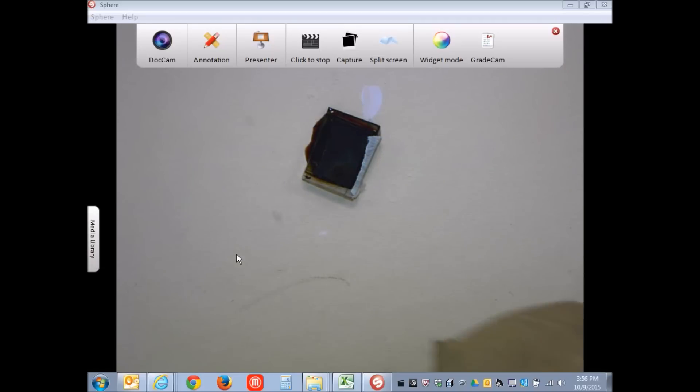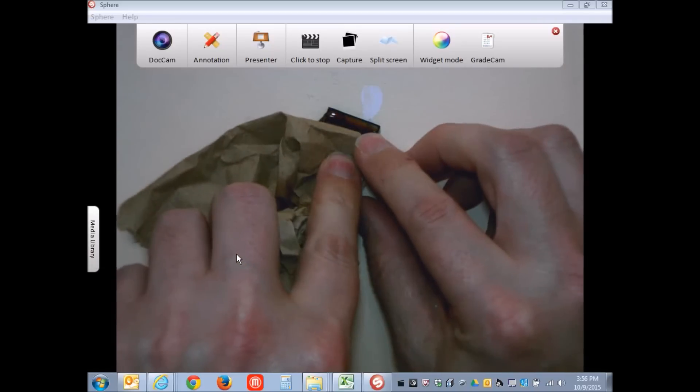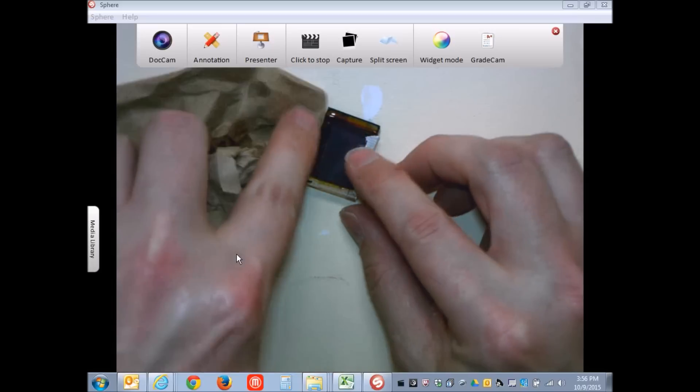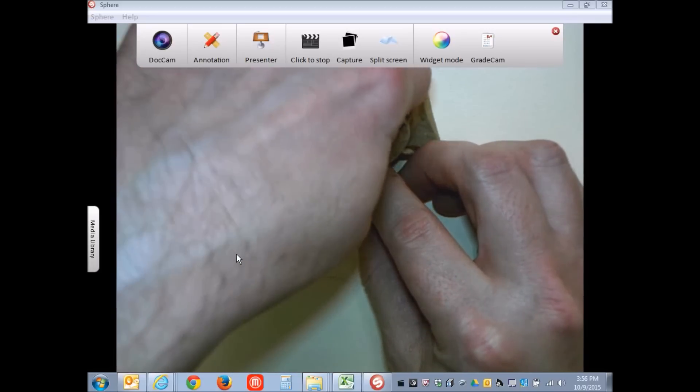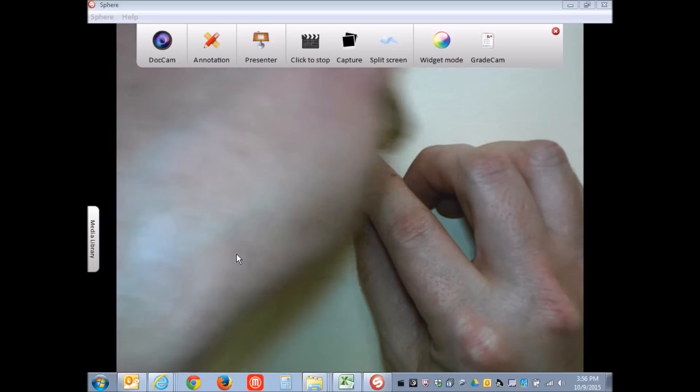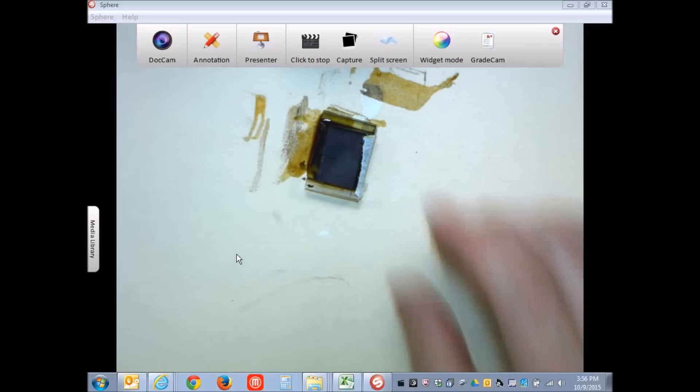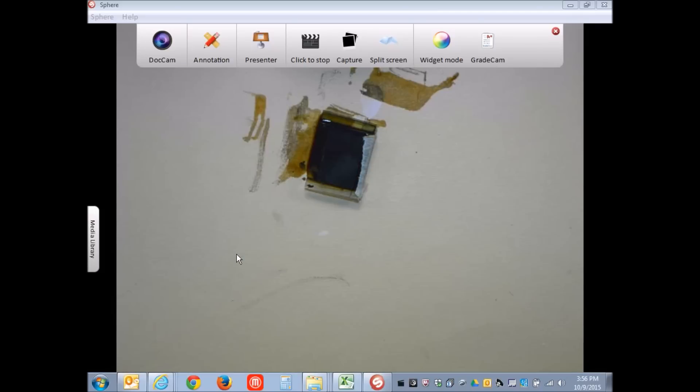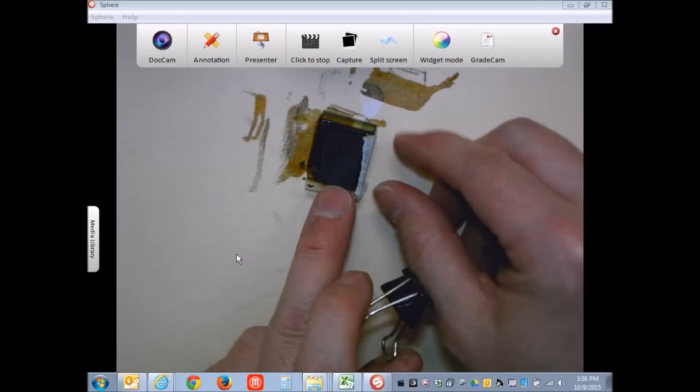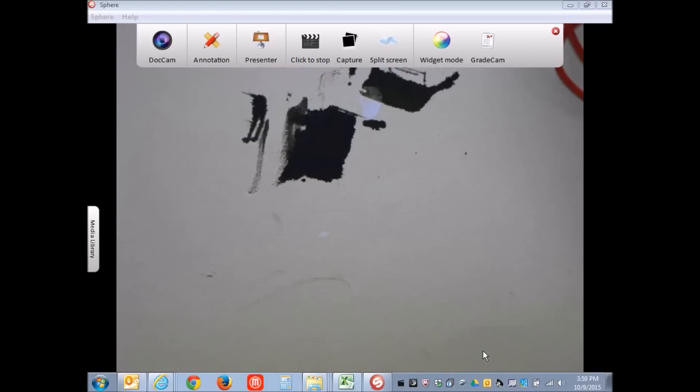If you don't want to get iodide, which stains your fingers, you can wear gloves. In fact, it's recommended. Once that's done, we'll put a binder clip on the other side to hold it closed and we can go out and test.